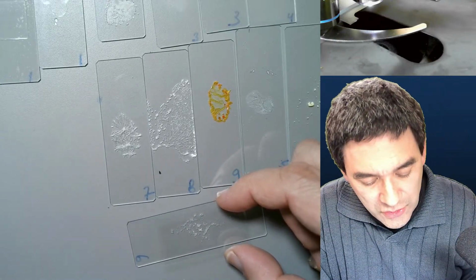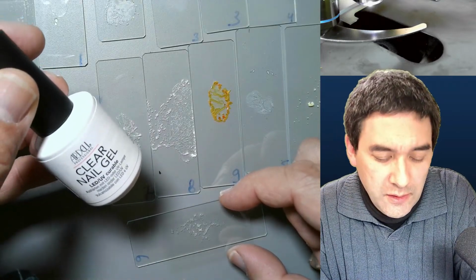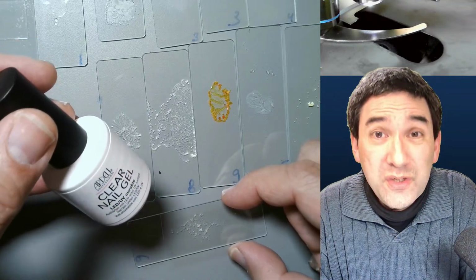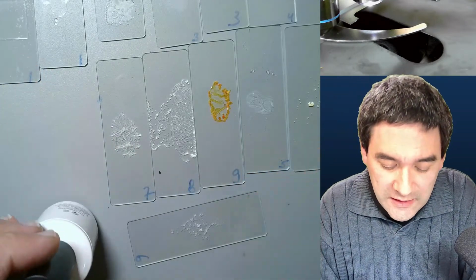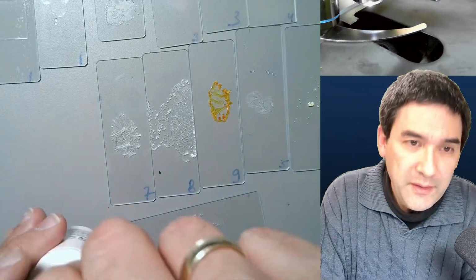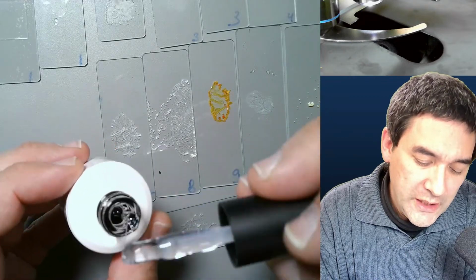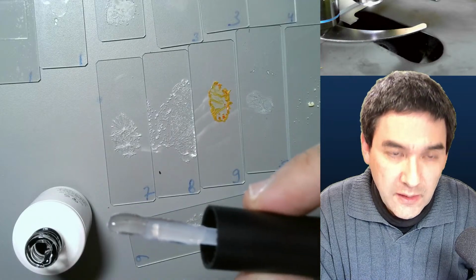And this is to use this ultraviolet curing clear nail gel, which was surprisingly expensive. I think I paid around 15 euros for this bottle here. I was kind of hoping to use this as a mounting medium. But it's too thick. It's really like a gel. So what I'm going to do now, and again, this is the first time that I'm trying this with the crystals. Okay, look, it looks like this. It's really like a gel, thick, way too thick as a mounting medium.